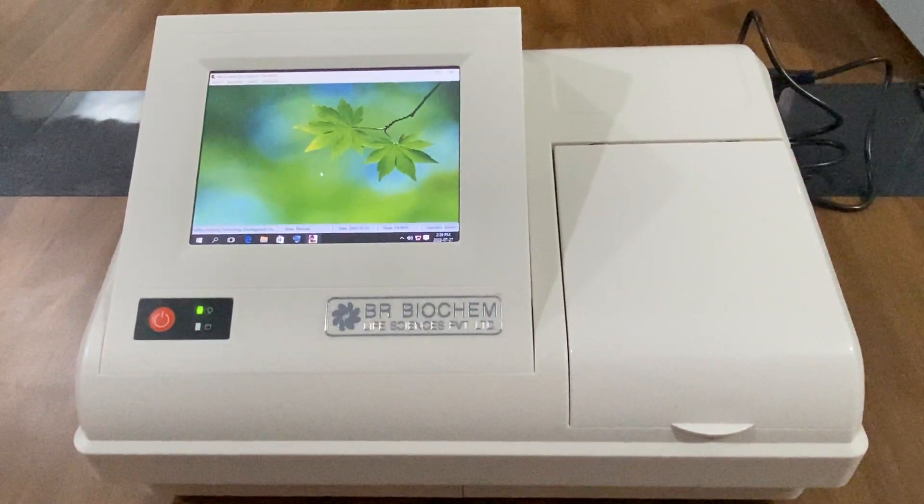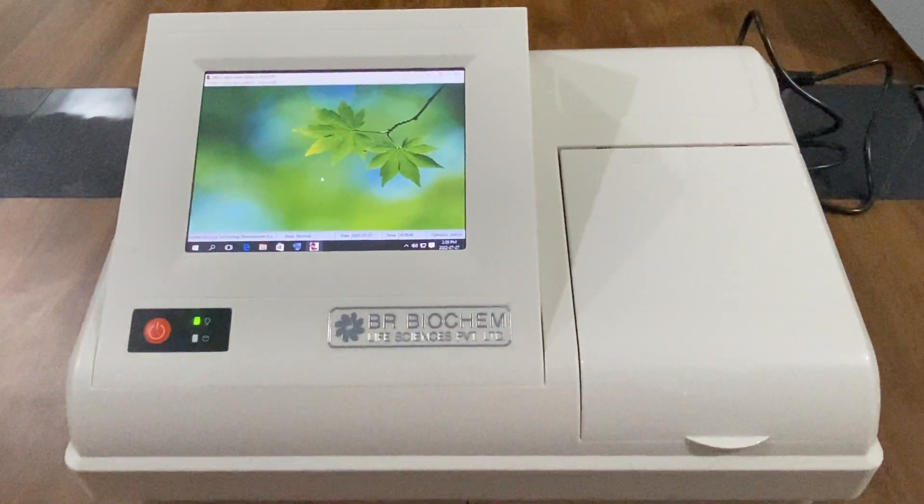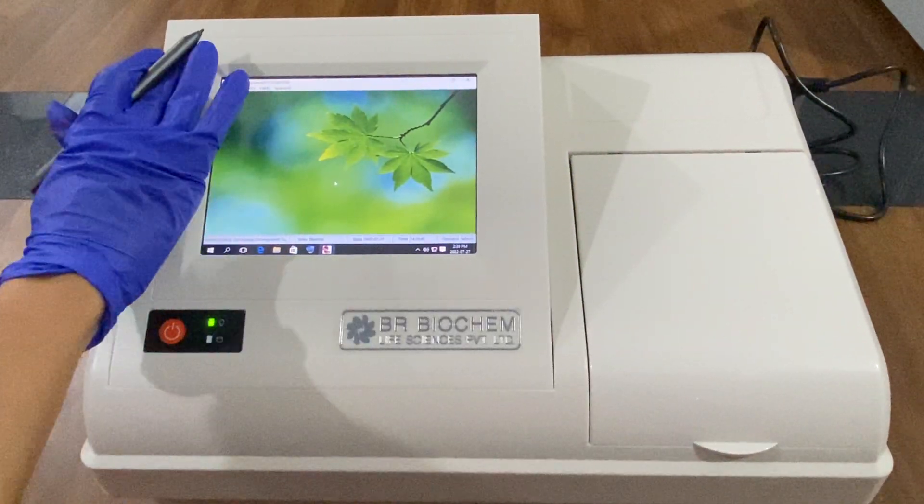In this ELISA reader, there is an inbuilt XP system and a touchscreen display of 8 inches.